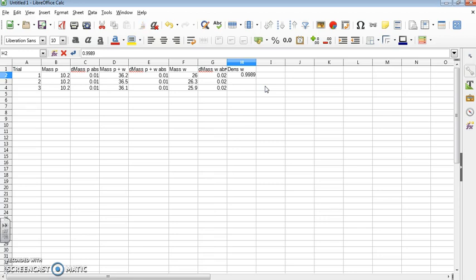0.99890. You might have a slightly different value. You notice it gets rid of the 0 for me. Right now I don't care about that. And I will just fill that down. Same thing. Notice it added a 1 each time, so I need to actually put equals that and fill it down instead. Now it won't automatically add a 1 when I fill down.